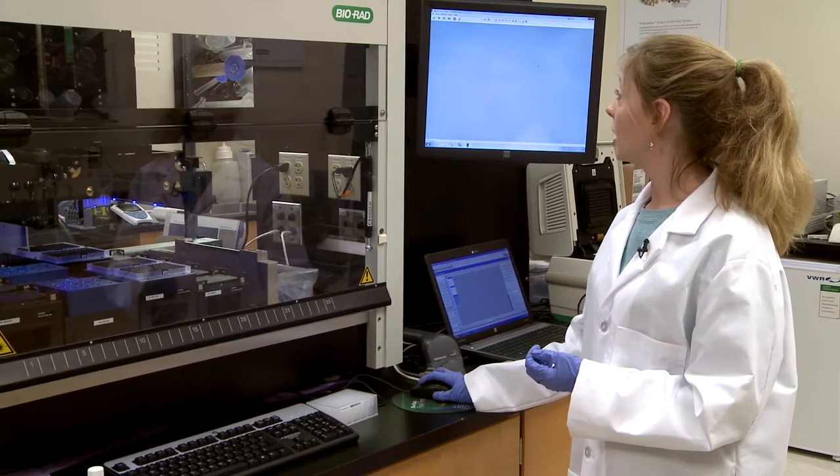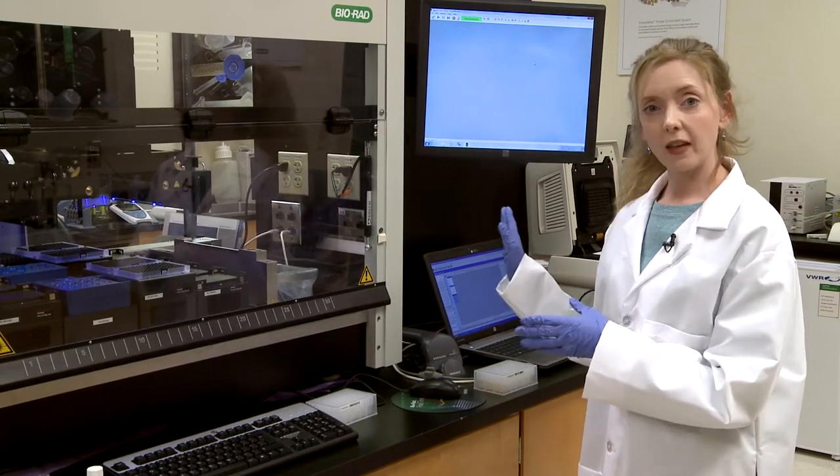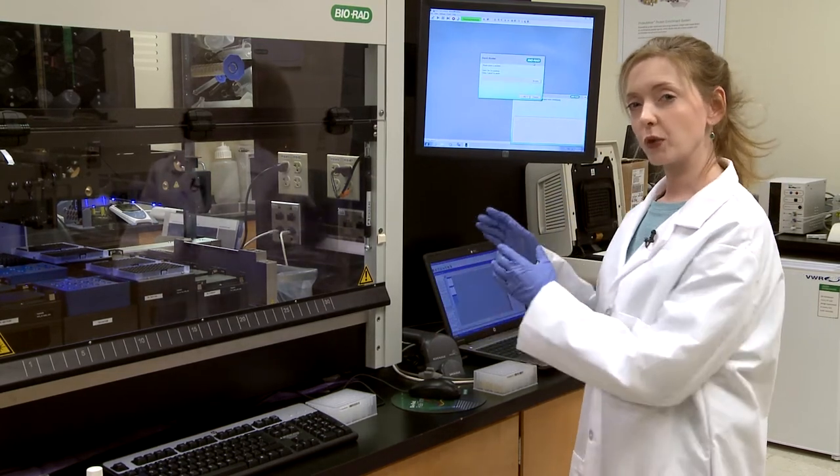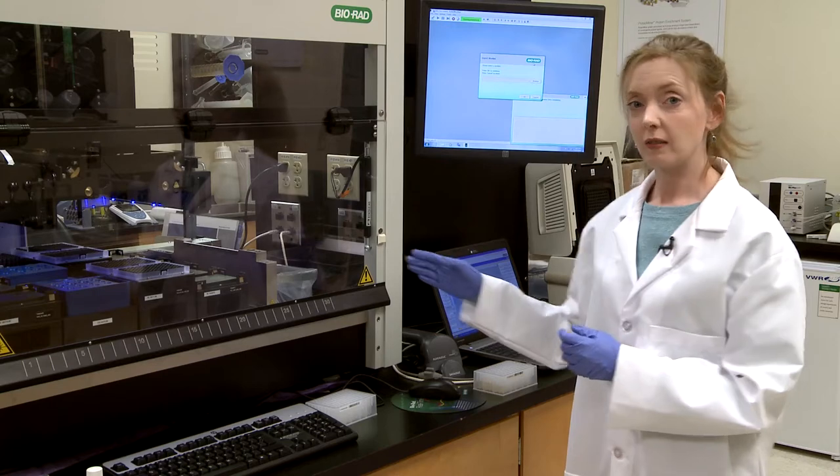So now open up the file. The great thing about using the robot is it gives you indications about what reagents and what samples to add in what locations. It's really easy.